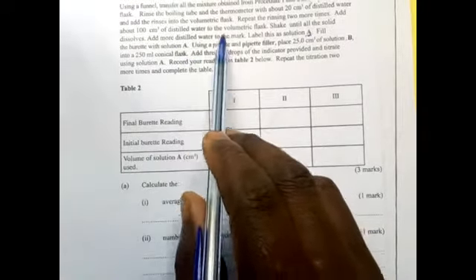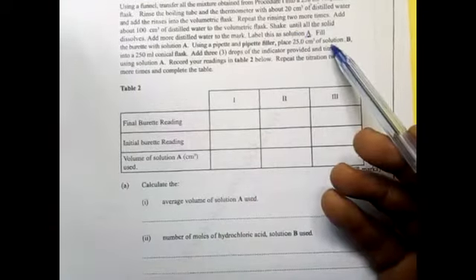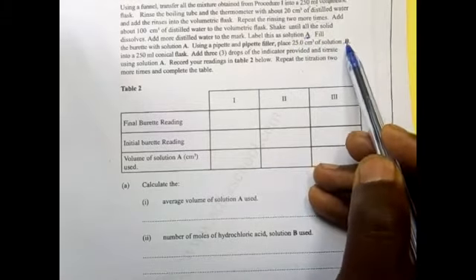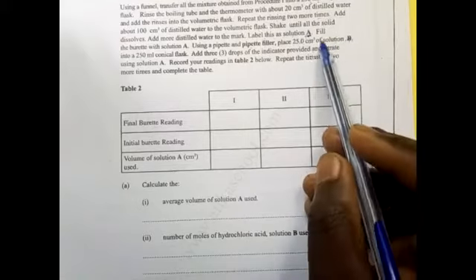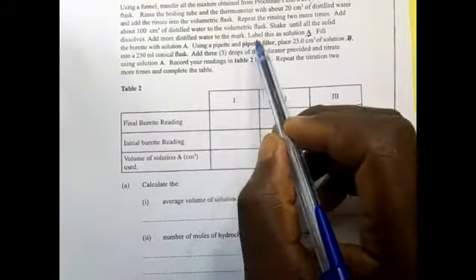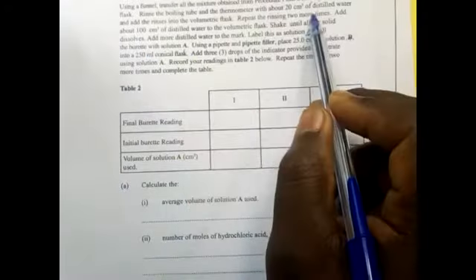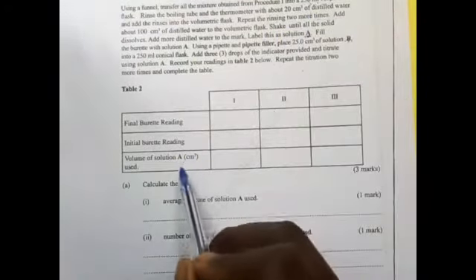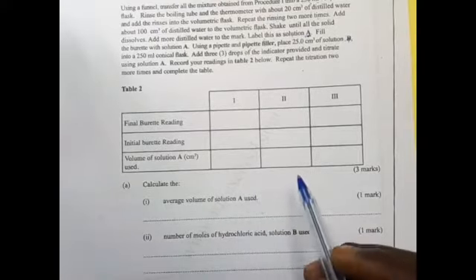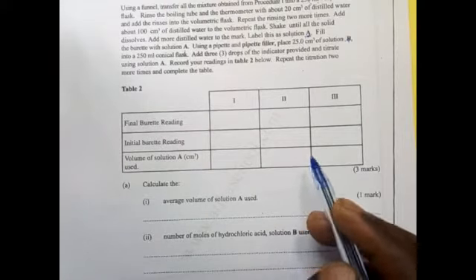I hope you understand the procedure. Which solution do we have in the burette? Which one are we pipetting? We are pipetting 25 of solution B, which is HCl. And the solution in the burette, because we are told to fill the burette with solution A, is the one we have prepared. So the average volume we are going to get here is for solution A. That one is important for you to understand. So let us use this average volume. We want to use 30.8.